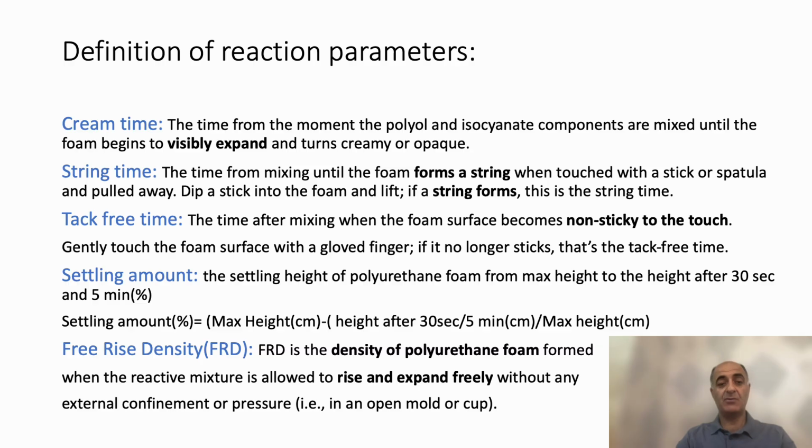And tack-free time shows you the surface cure of the final foam. The longer the tack-free time, the poorer the surface cure will be.